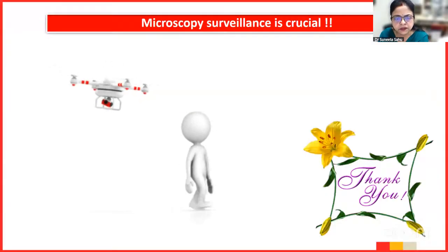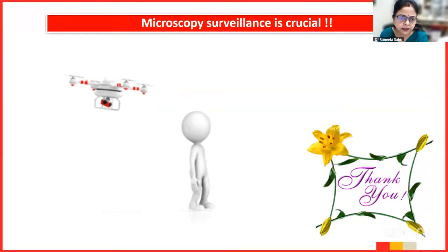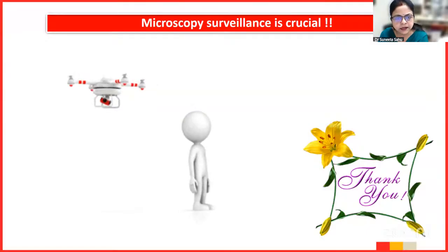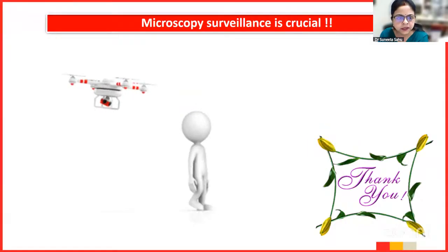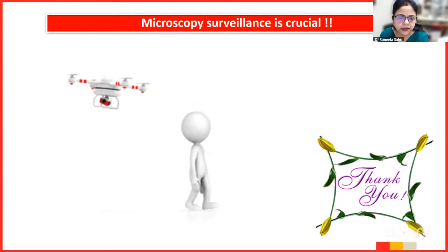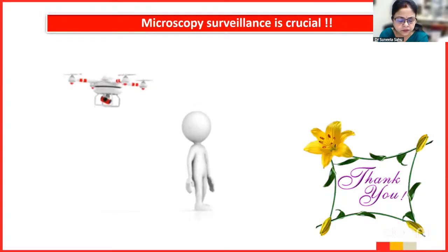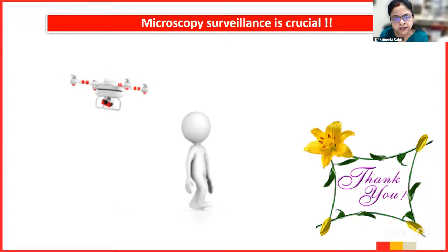Gram stain gives us lots of guidance, and gram stain should be done properly. All types of microscopy, all types of stain will give a rapid diagnosis. Let it be a Zn stain, let it be an Albert stain, or let it be a negative stain, or a wet mount. Any type of microscopy gives us a lot of clues and helps us in giving some diagnosis to the clinicians.